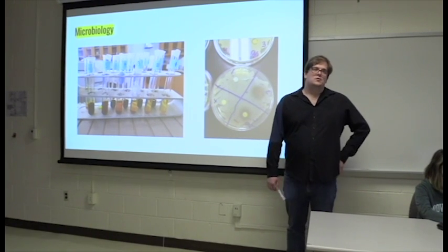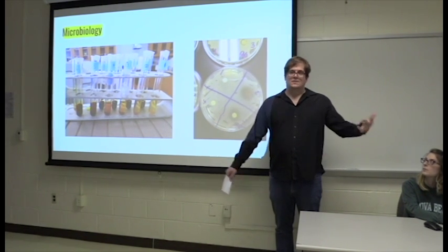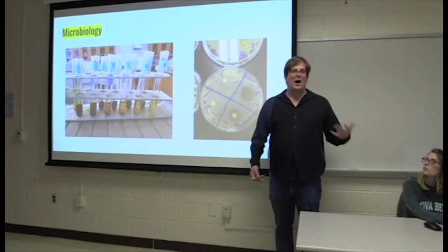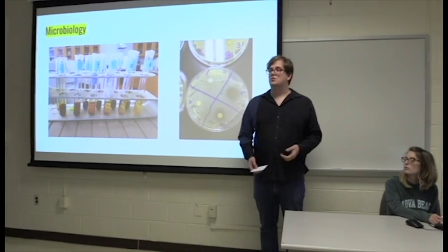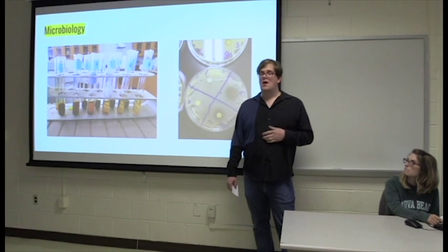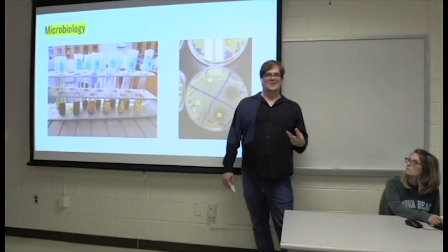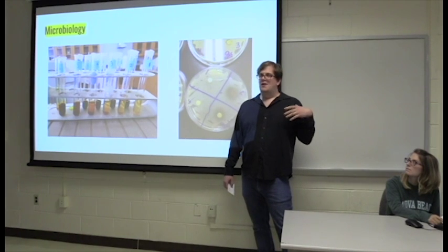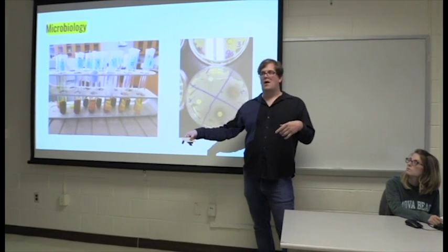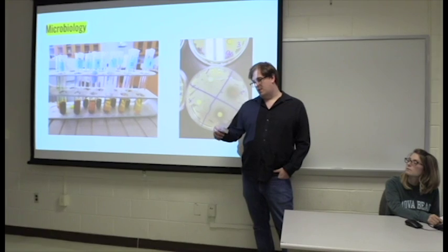Also, we had a microbiological contingent of this project, and we inoculated plates with 6 different types of bacteria, gram-positives and negatives, etc. We controlled for things like concentration, pH, the presence of ion, the identity of the ion, to try to see if different complexes would work. Across all of these different controls, we didn't really see the complexes outperforming pure curcumin, with the exception of one, where it was the copper ion with a high concentration of ion with Bacillus subtilis, which is one specific bacteria. So ultimately, we can't quite make any conclusions about the effectiveness of the complex over the curcumin itself, but we do have a good direction forward for doing further microbiological studies.